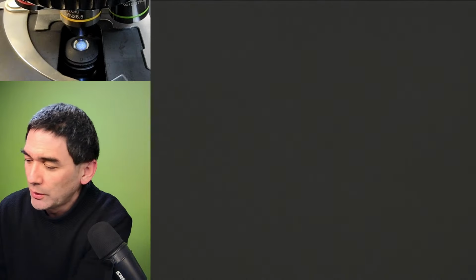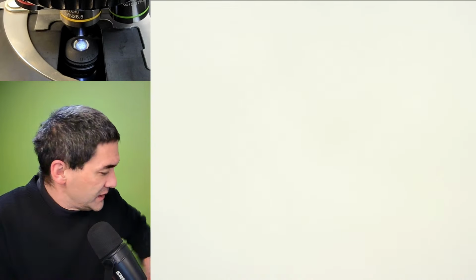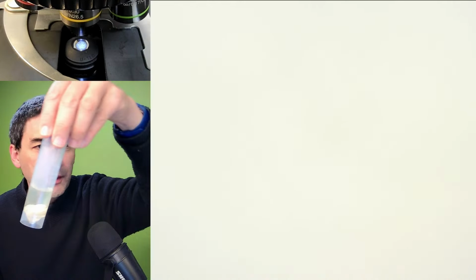The other one that I want to show you is a water sample, which is interesting in the sense that it shows how much pollution this causes. This is from a washing machine. I've collected a little sample of washing machine water. And then I also have over here something that I would like to put under the microscope.